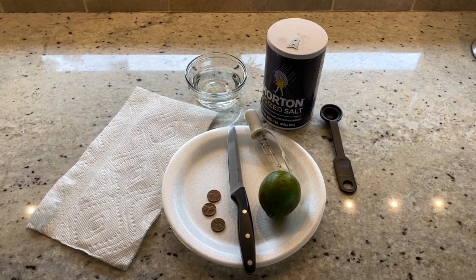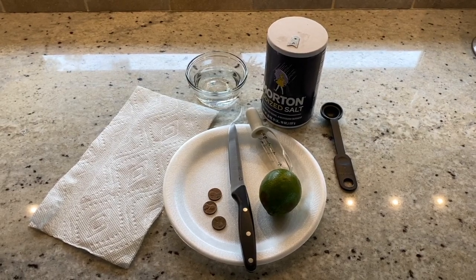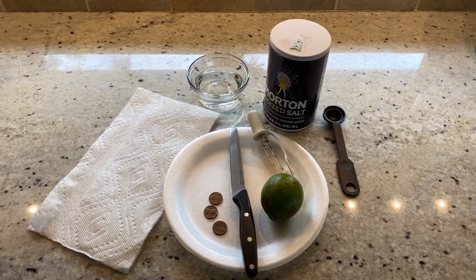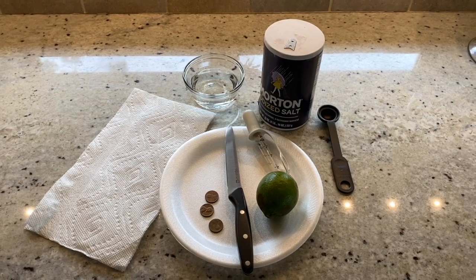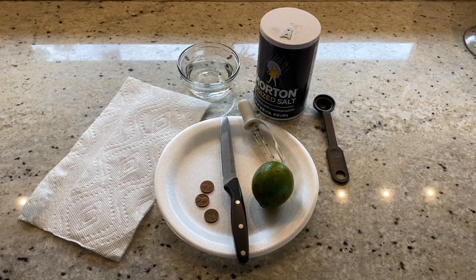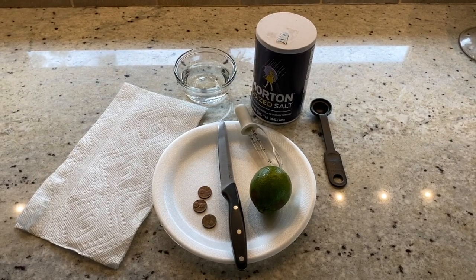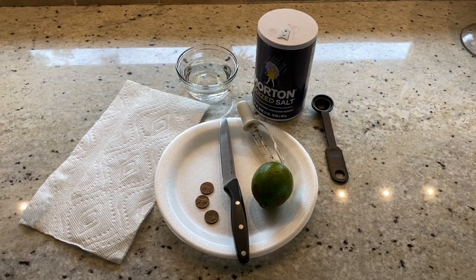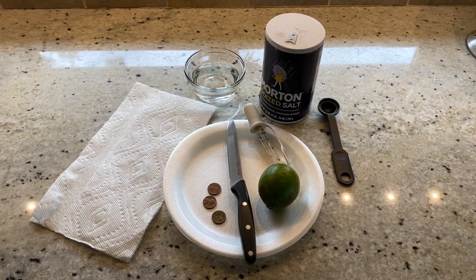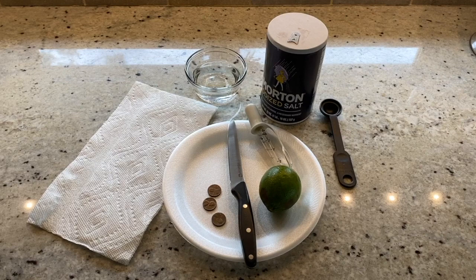These are the materials you'll need: a paper towel, a little bit of water, a plate, three tarnished pennies — preferably between 1962 and 1982, as according to the book they work the best — a knife, a dropper, and one teaspoon of salt. They suggested using a lemon, but we didn't have one on hand. We have a lime that is actually starting to rot, so we decided to give it a try and just use it up.